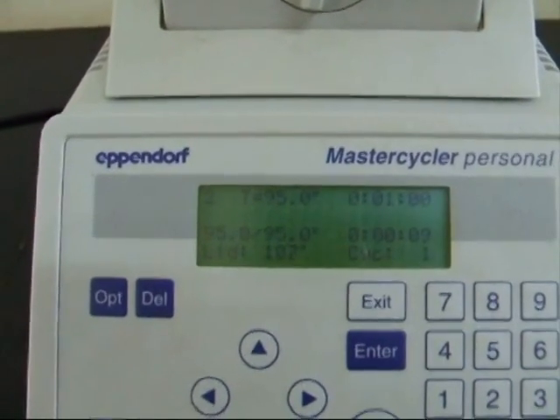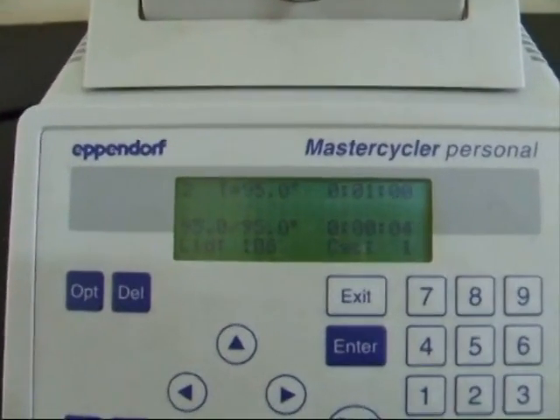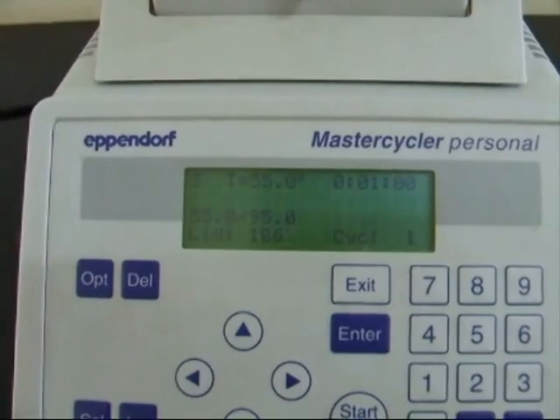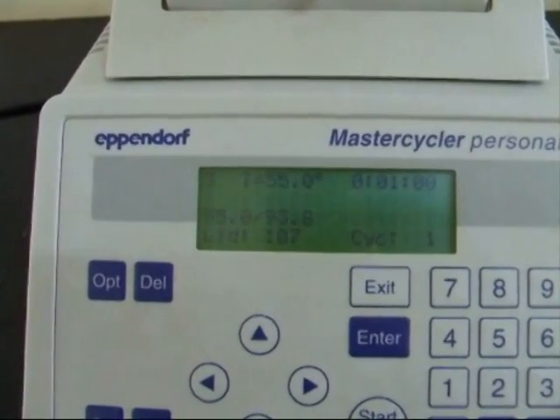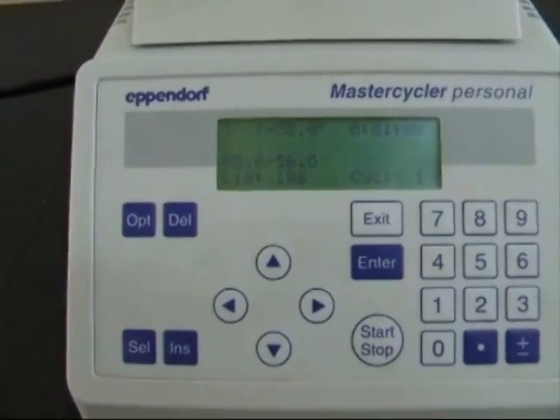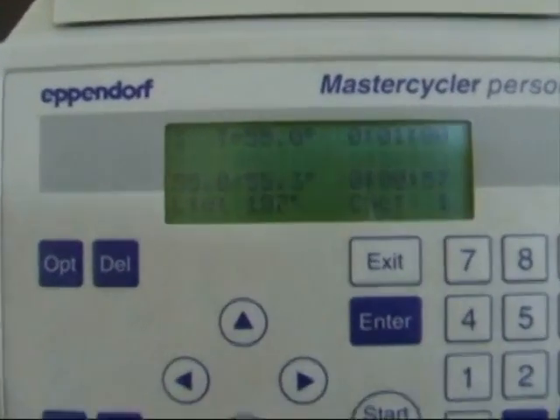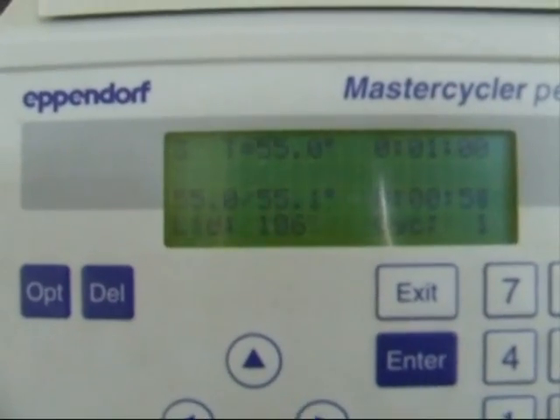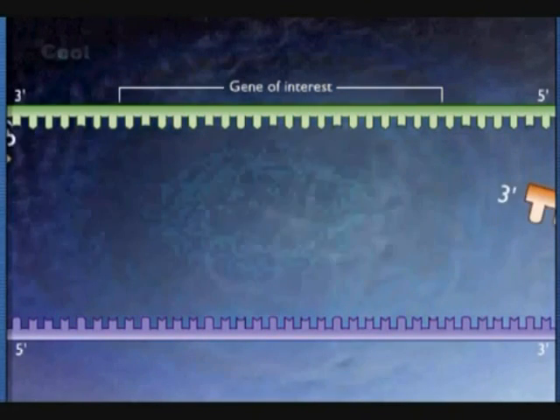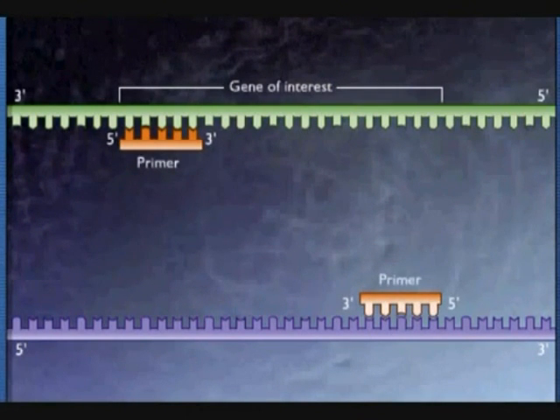When the initial denaturation step gets over, it goes to the next step, where it cools to 55 degrees centigrade for annealing. During annealing, the primers go and bind to the gene of interest.